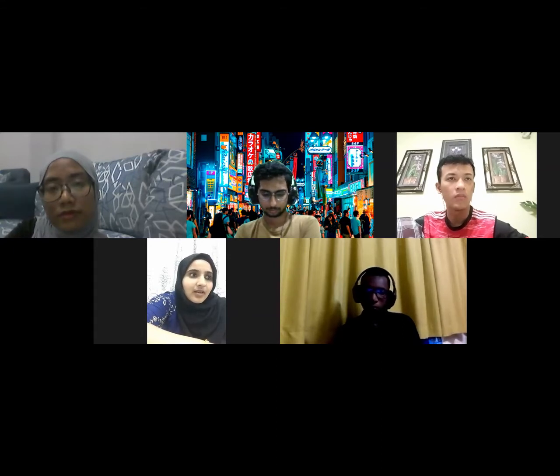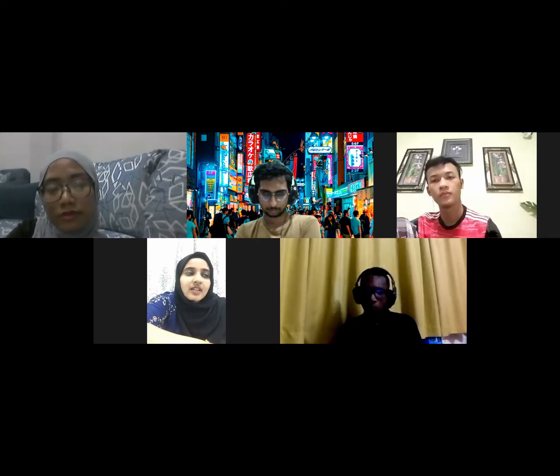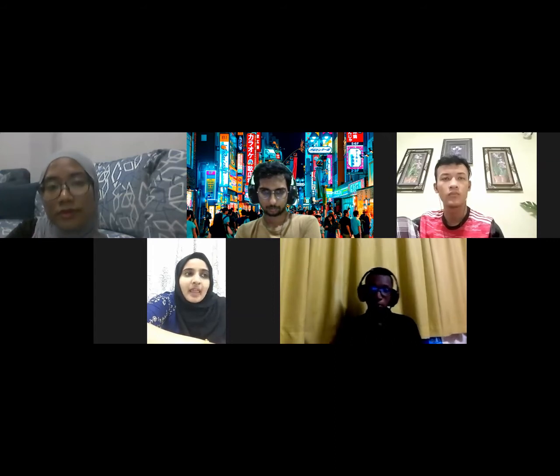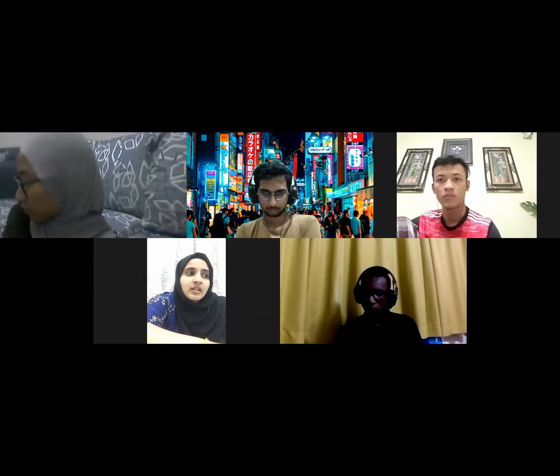I know it's quite low. For GC content, the forward is 50 and the reverse is quite low, 33. The self-complementarity is also quite high, 5 and 4. For the 5', 3' of the reverse primer, it's 4. So I don't think it's a good primer.